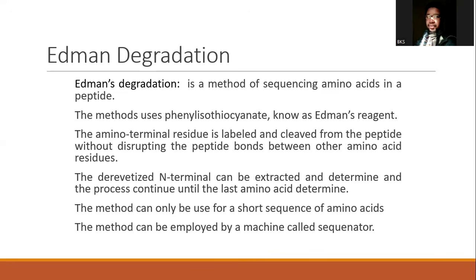This phenylthiocarbamyl adduct, in the presence of trifluoroacetic acid, allows the peptide bond holding the N-terminal amino acid alone to be broken. Once it is broken, the peptide chain is released, while the adduct is also released alone.